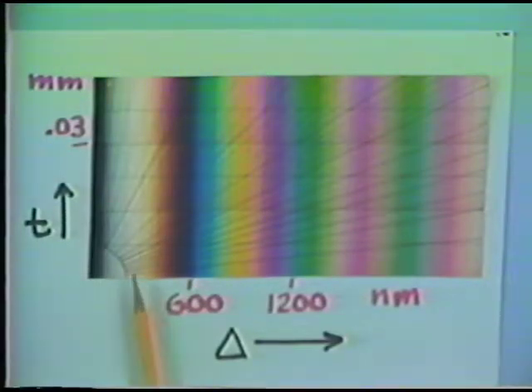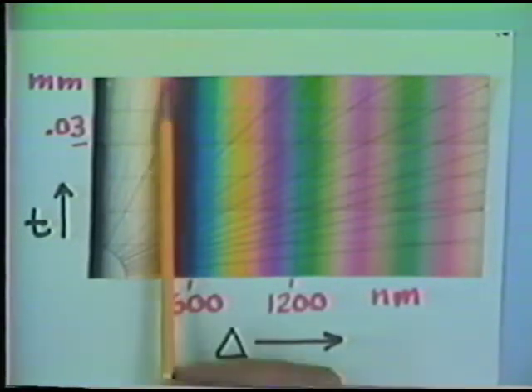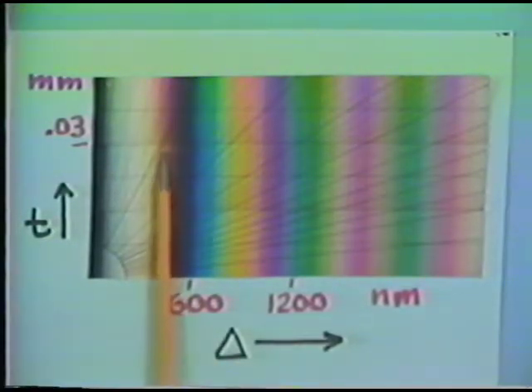Couple hundred, 150 to 200 nanometers typically. Now if we use the mica plate, the maximum interference color will be increased by about another 150 nanometers. So we'll move over in this direction to this kind of a color. So those grains with their slow rays parallel to the slow rays in the mica plate will have maximum interference colors now in this particular kind of region.